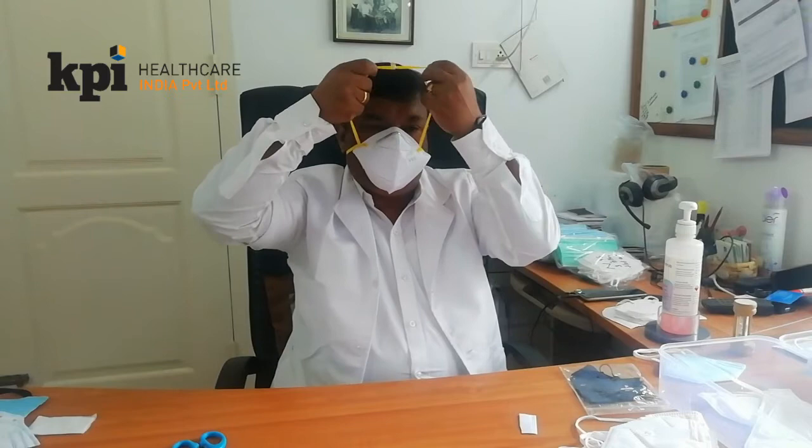As you can see, there is absolutely no leakage. You just put the lock here to secure it. And when you wear glasses, nothing happens. Thank you very much.